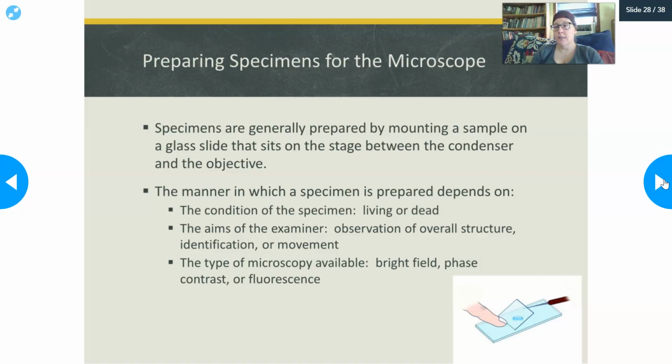You can see white cells moving around, but if there is Trichomonas, which is a little parasite that has a flagella and swims, you'll see it swim across your field. You have to be able to see that motion to call that Trichomonas. So that would be a wet mount.